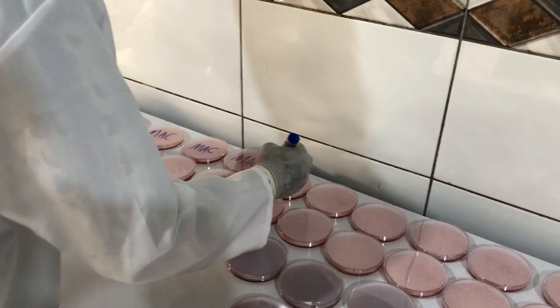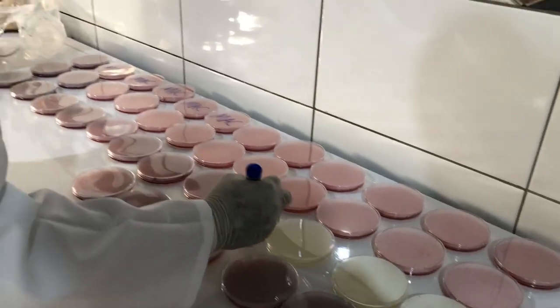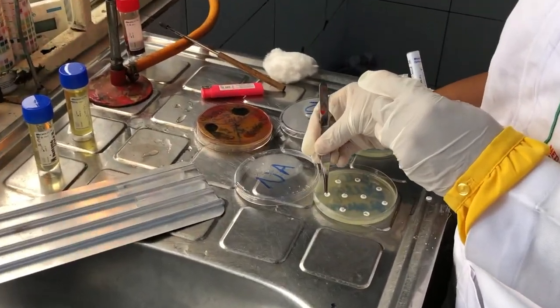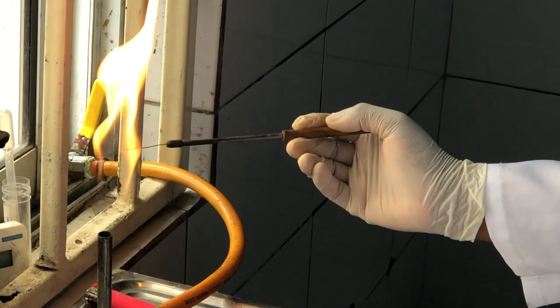Usually after the agar has been dispensed, I label them to ensure that I differentiate agars that have the same colour as each other. At this point my supervisor was putting antibiotics to some samples that we had inoculated earlier, and after that she let me take over with the stool samples.